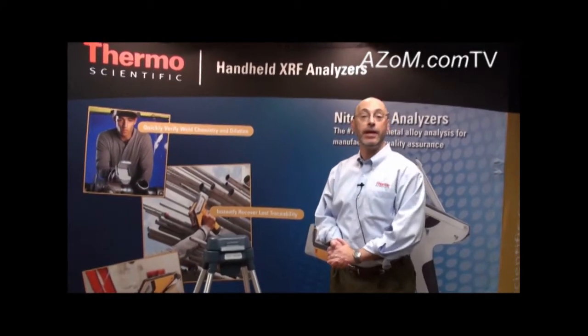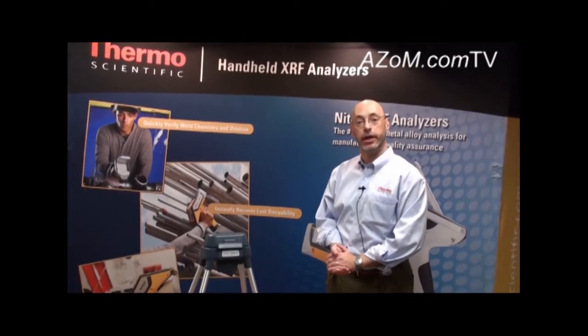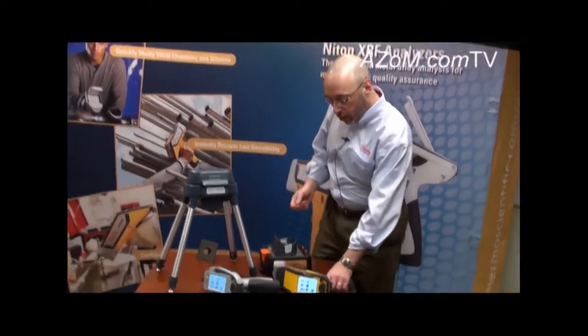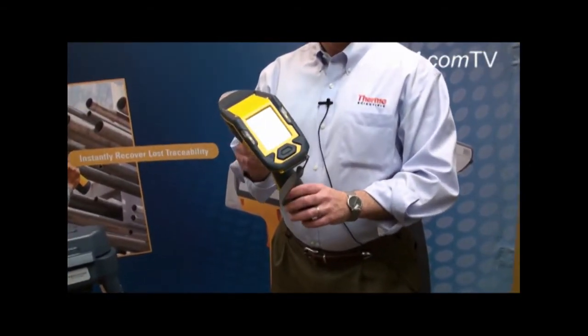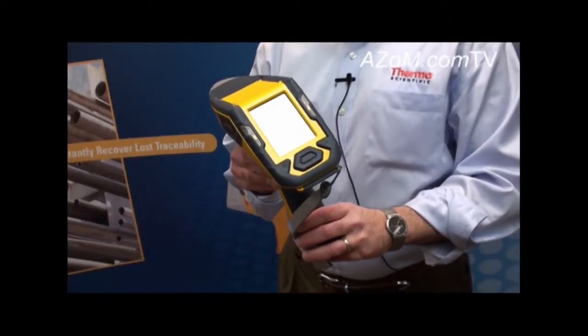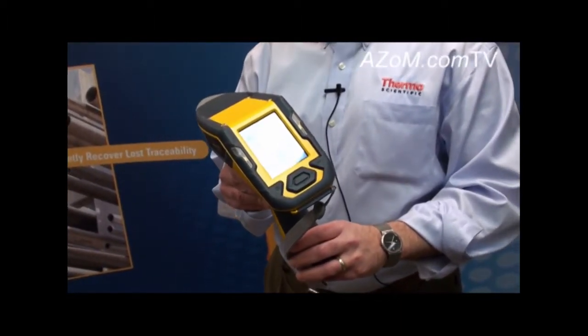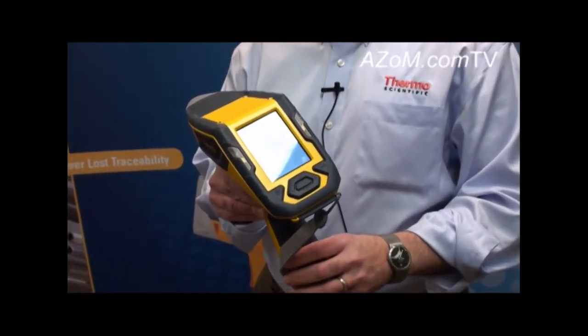What we're going to talk about today is the handheld Thermo Scientific Niton XRF analyzers. To start off, we're going to introduce you to the Niton XL2. This is our value offering in handheld XRF analysis, and it's ideal for a number of different applications, including scrap metal recycling and general metal alloy analysis.